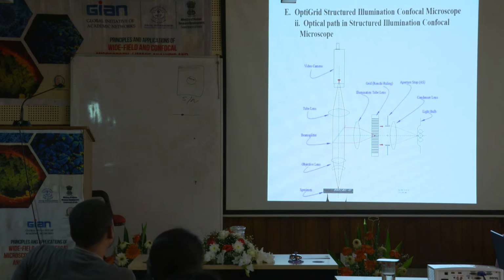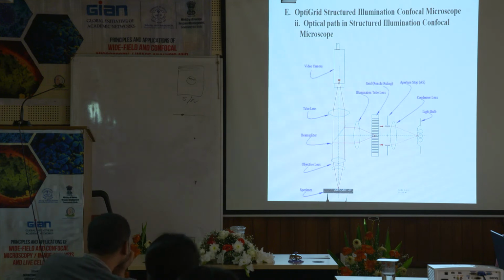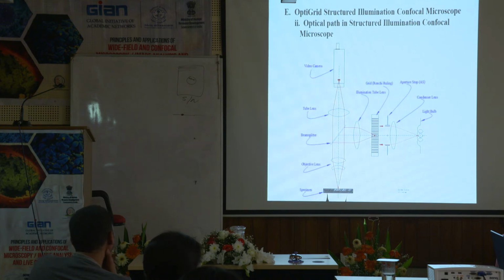This one's sort of weird. I've used them a couple times in my life, and it worked okay. Some people swear by them. I have one lab that has one, and they absolutely love it, because I think it's very sample dependent whether it works or not. It's called an Optigrid, and I think some of the other companies have them out now, but Zeiss, the German company, was always the one that had this thing. It's a little bit different idea, but again, it's a confocal sort of, in a way.